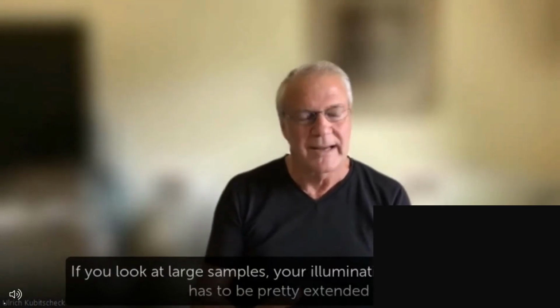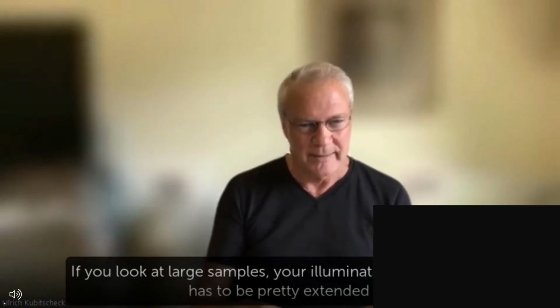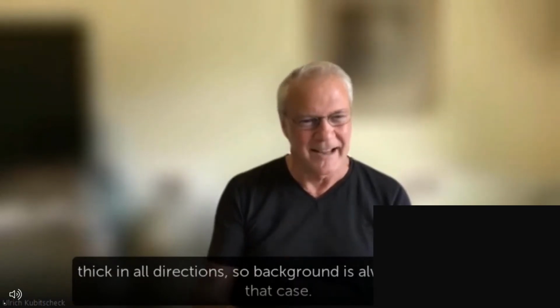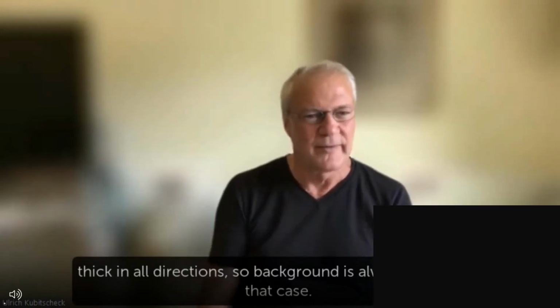If you look at large samples, your illumination beam always has to be pretty extended, thick, in all directions. So background is always an issue in that case.